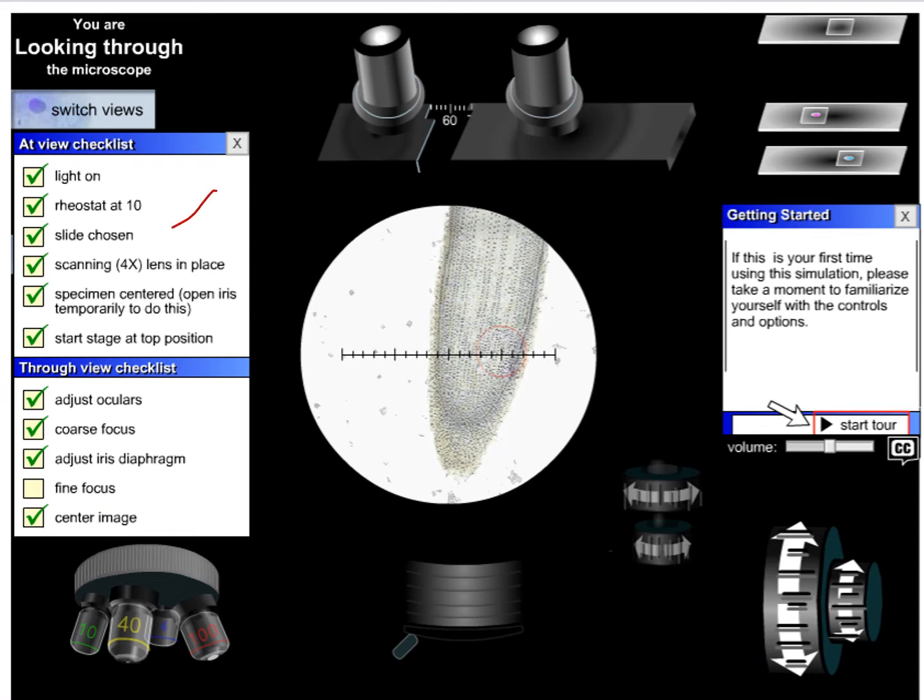If you need to check the through view, what you do is you're going to go up here and click on switch views, and then you'll be moved to another field of view that tries to basically simulate actually looking through the eyepieces, and then you'll need to adjust some things to make all of these checks come here. So did you adjust the oculars? That means these two fellows up here. Have you adjusted the coarse focus, the iris diaphragm that is right down here, the fine focus, and then also have you centered the image? You need to experiment with moving all of these various manipulatables, the focus, the stage, left, right, forward, back, all that.